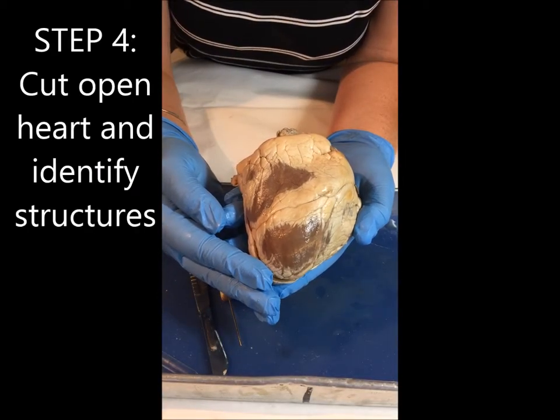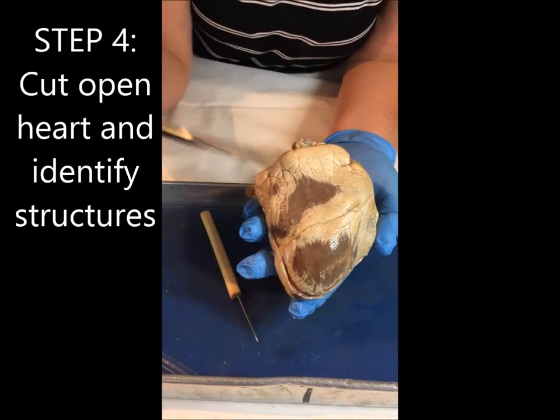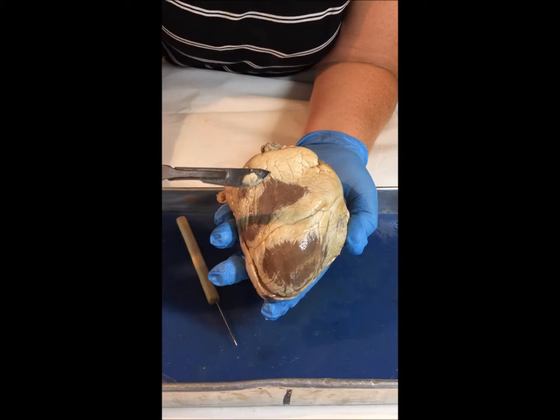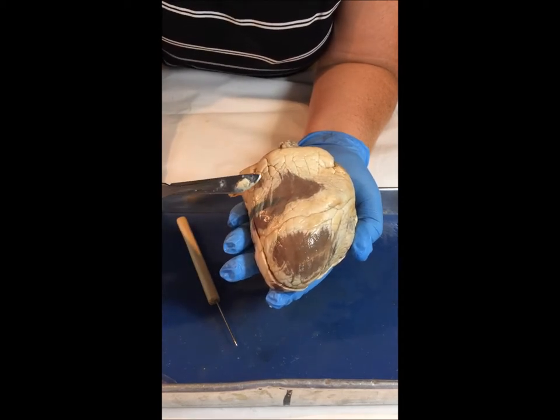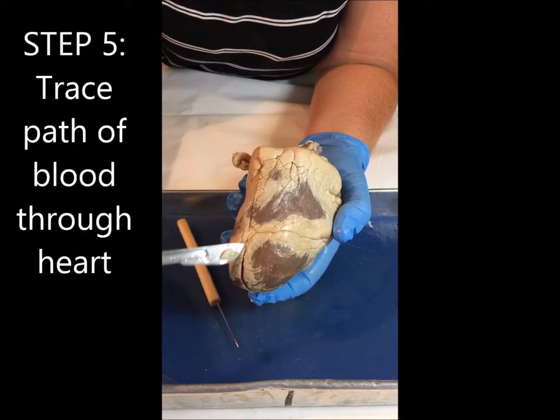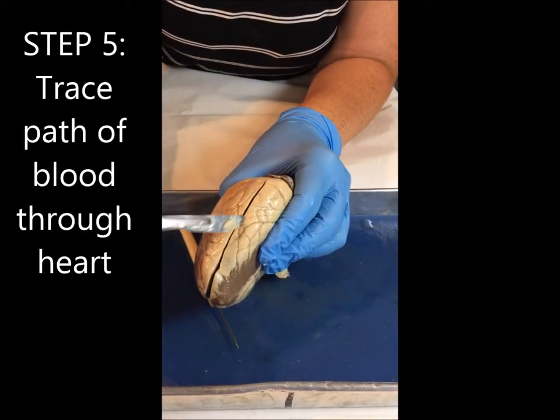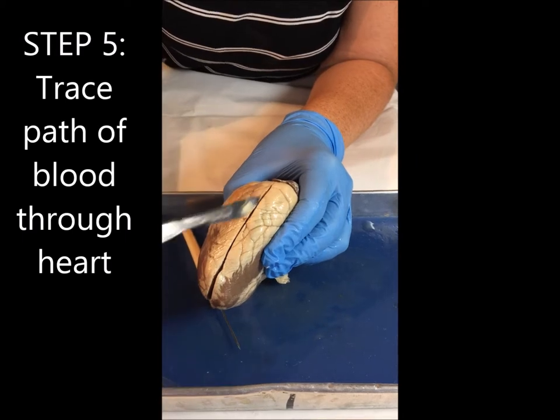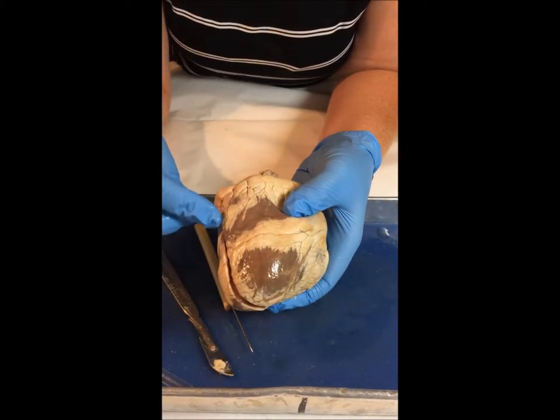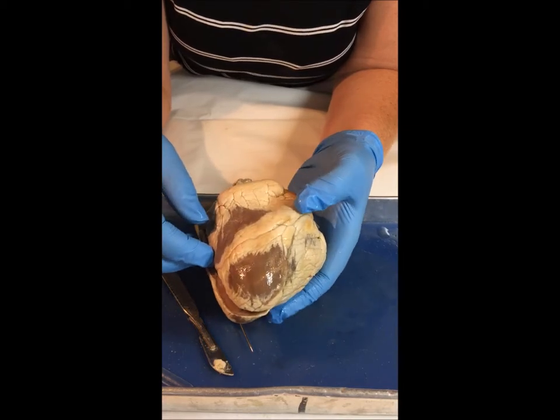When you are ready to start cutting, you want to use your scalpel, and a sharp blade will be best because it will prevent cuts to yourself so you won't have to saw. You want to cut superficially first and just make a line on each side. Then you can cut through more, but it's always better to cut a little bit less deep than it is to cut through everything.